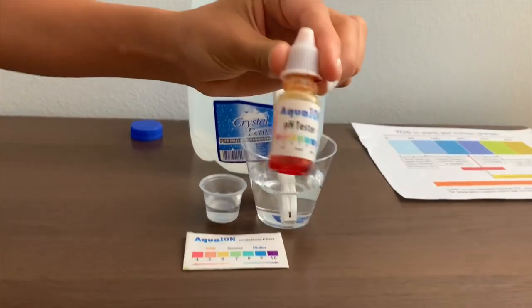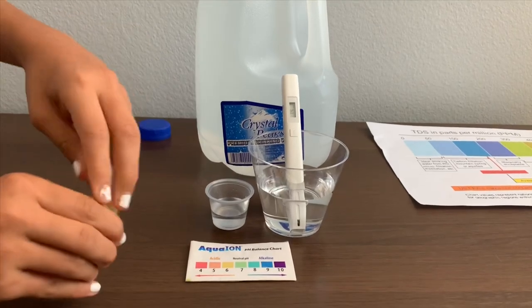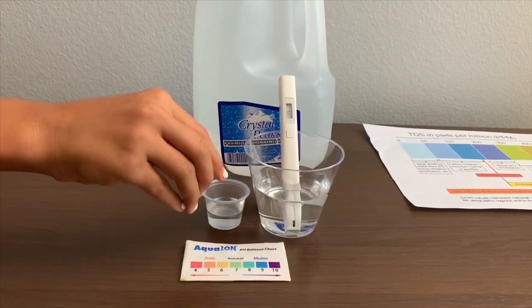Now let's test the pH level. If you want to buy this pH tester, check the link down below. Make sure you do two drops only.